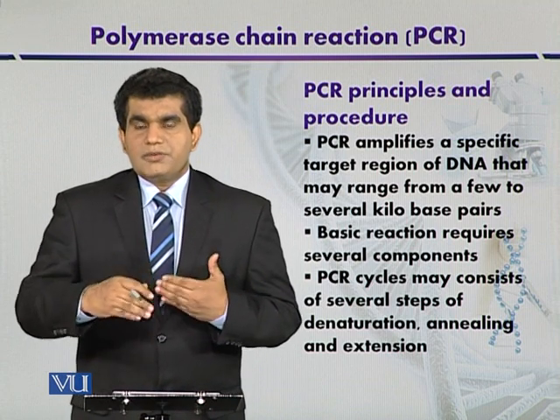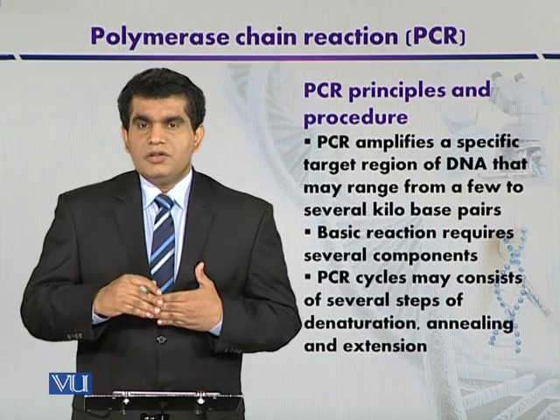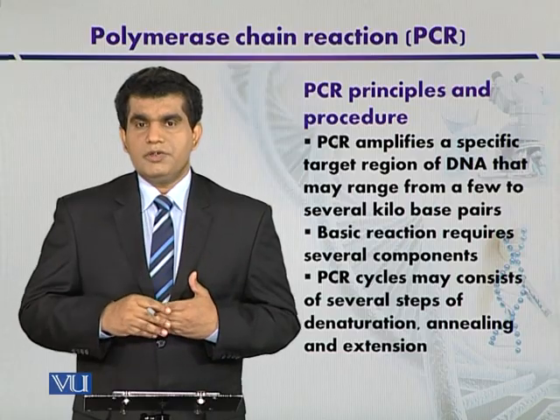So when all the steps are completed, as I explained in the last topic, due to the exponential increase in DNA concentration, we may have millions of copies of the DNA.